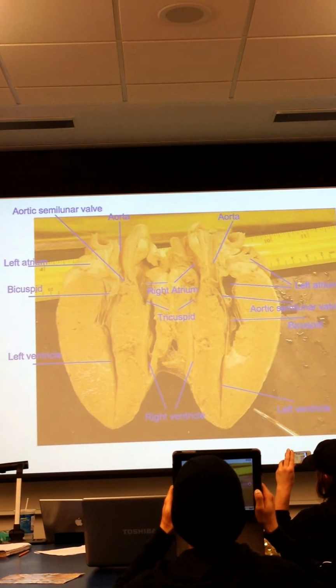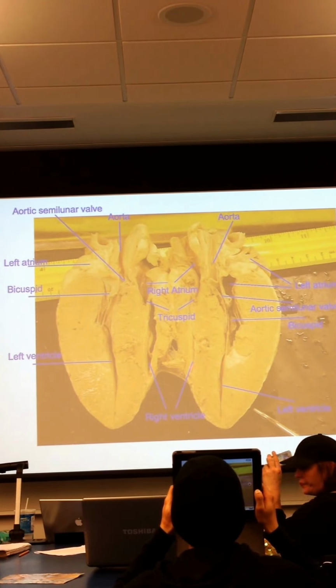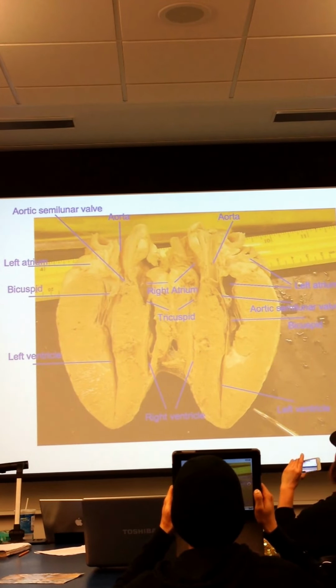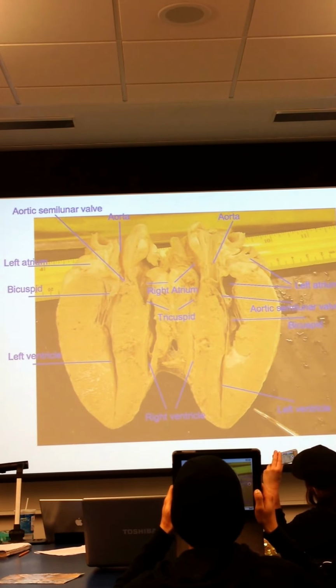They're all mammalian hearts, and they all have the exact same structure. It's just really hard to find good dissection pictures online. So it's actually got nothing to do with the species, it's just the way they cut it open, where it looks much more tissue-y than the other ones. You can't see the openings as well. It has a lot to do with the way they cut through the heart.